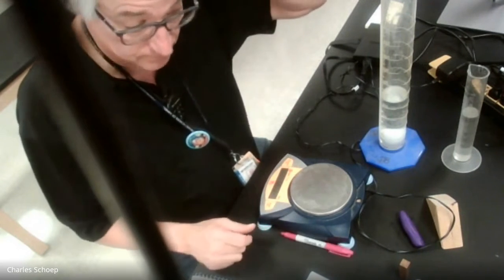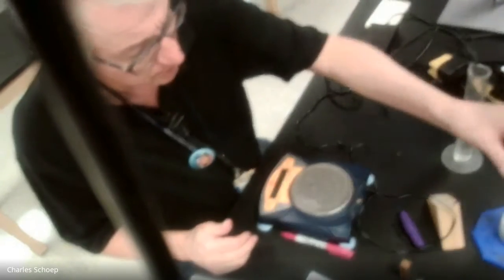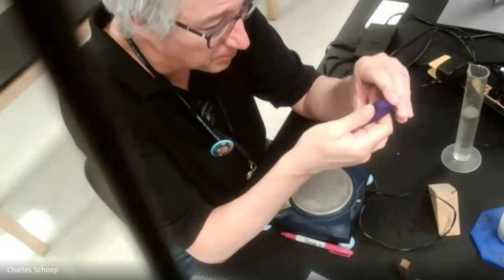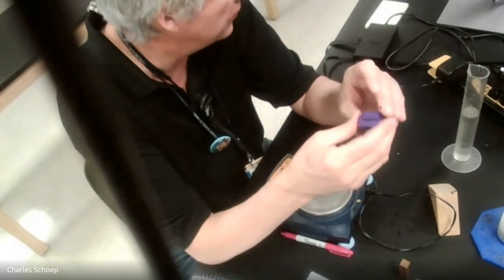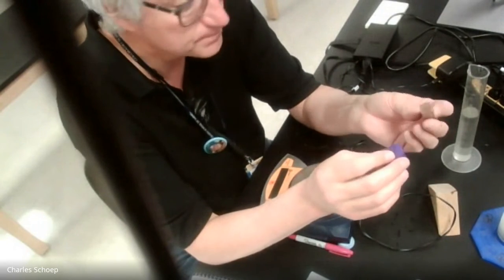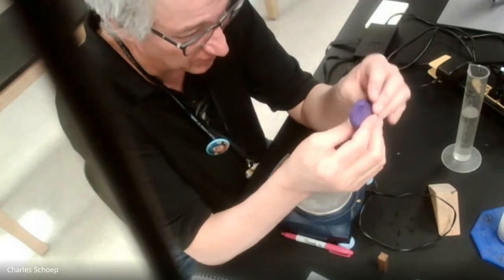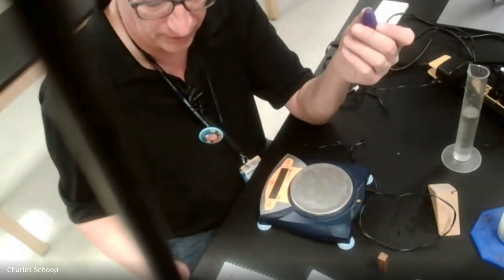Okay? And number two, now, I could try and make my modeling clay into what's called a regular solid. A regular solid is something that has a consistent shape. This is kind of an irregular solid. It has a weird shape. Irregular solids don't lend themselves to length and width and height.